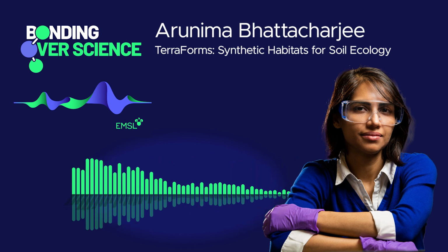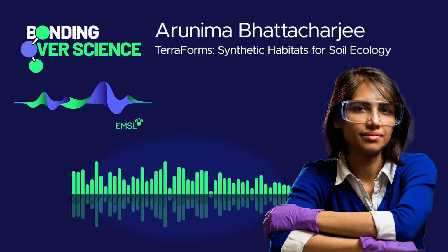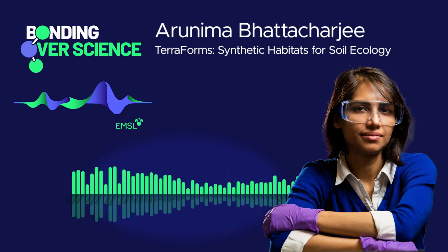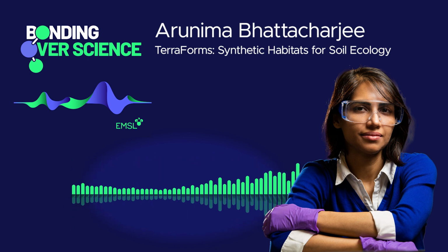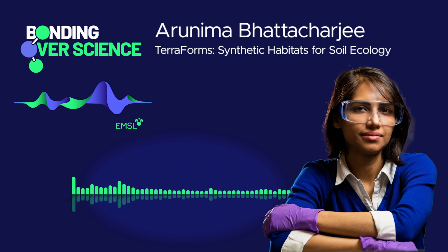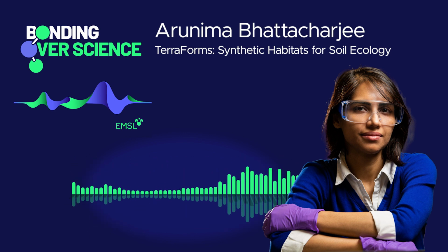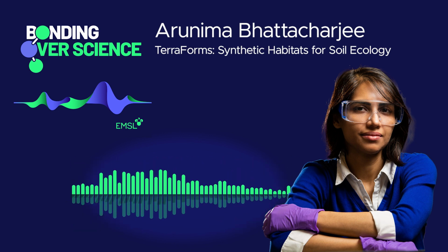I think that's why. I also want to give you the opportunity to add anything else that you think we should know. Well, I know this is a super interesting and exciting capability, and there is a lot of demand. Fabricating these devices is still something that we do in house. We are not training users on that, but we would like to train users how to prep their own samples so that we can ship these chips to their respective labs. They can do their own incubation and growth, and then prep samples and send them back to us for mass spec. And if they want to know this, I encourage people to register for the user meeting and come to these workshops where you can teach them.